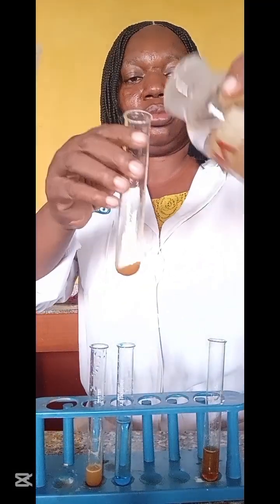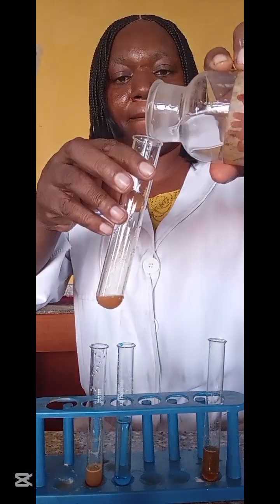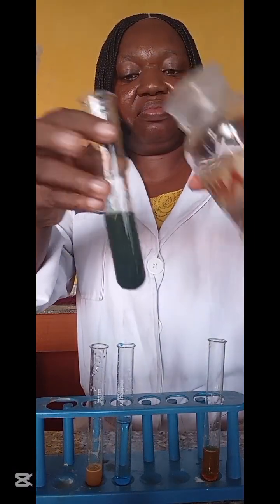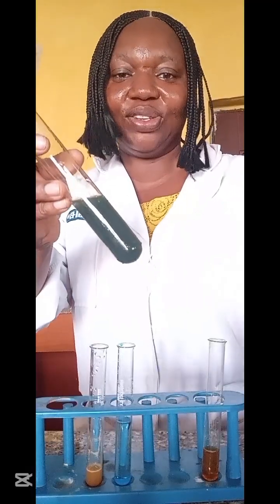Let's try it with ammonia. A dirty green gelatinous precipitate, insoluble in excess. So now let's go to the last one, which is copper.